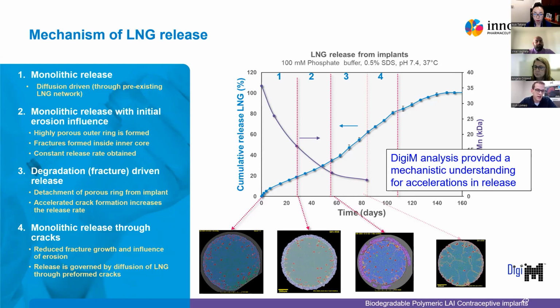And then at later time points, we actually see how that layer is peeling off. So that's going to give us essentially a new surface area to dissolve the drug from inside out. And then at our later time point here, we even see some cracks forming within the implant.